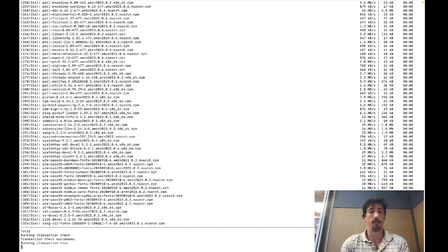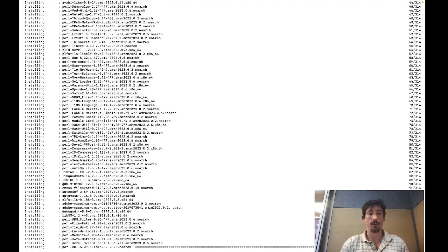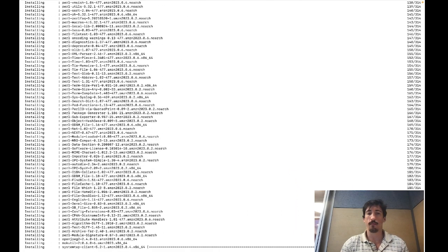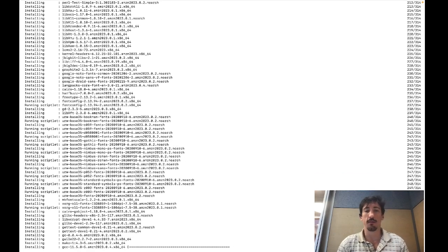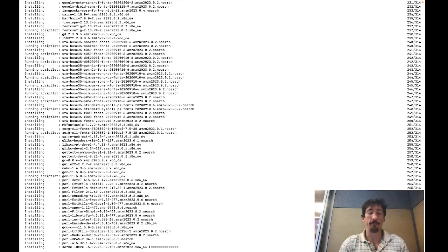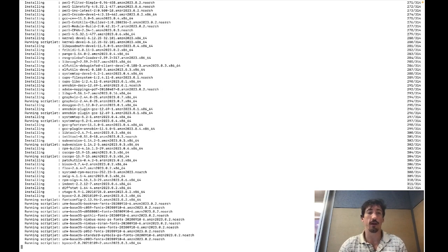And then next, we're going to install some compression and networking libraries that HTSLib depends on. Yeah, HTSLib needs a lot of different packages, you'll see. That needs to be installed for HTSLib to work correctly. But this is a really common thing we need to install, so this is not used just for SvABA. So save this video. If you're ever needing HTSLib again, you can install it the same way I'm doing it right now.